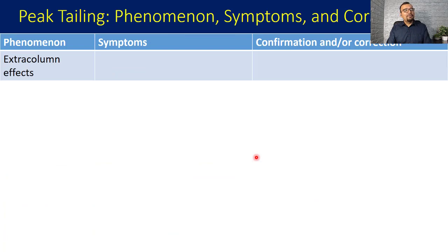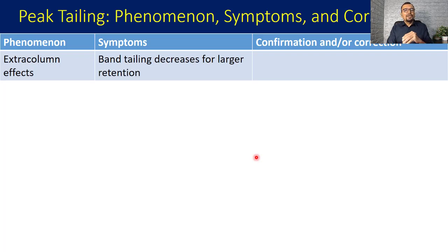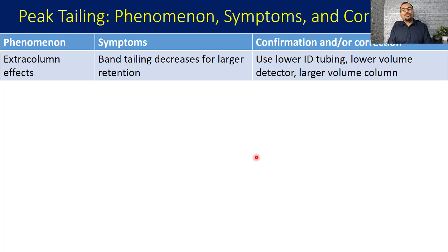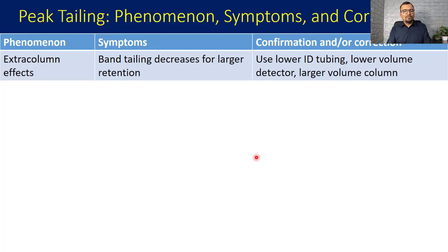Extra column effects always impact peak broadening. Band tailing decreases for larger retentions, so for early-eluting compounds you will always have a greater amount of peak tailing compared to late-eluting compounds. You can use lower inner diameter tubings to reduce the extra column volume, use detectors with lower volume, and consider using a larger column to have larger column volumes.